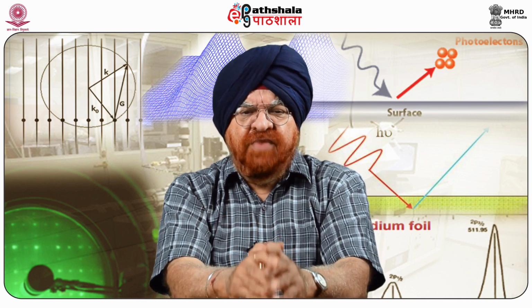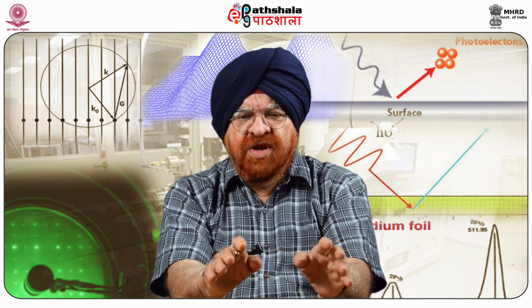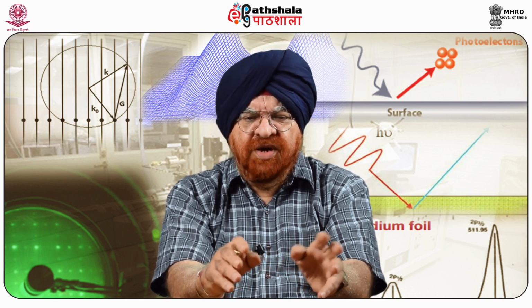Adhesion force measurement: adhesion forces measured under ambient conditions are dominated by capillary forces, which are usually several orders of magnitude stronger than the binding interactions between the fabricated tips and the sample. Roughness of the sample surface affects reproducibility of adhesion force measurement, as the sample approaches the tip at different angles during multiple measurements.